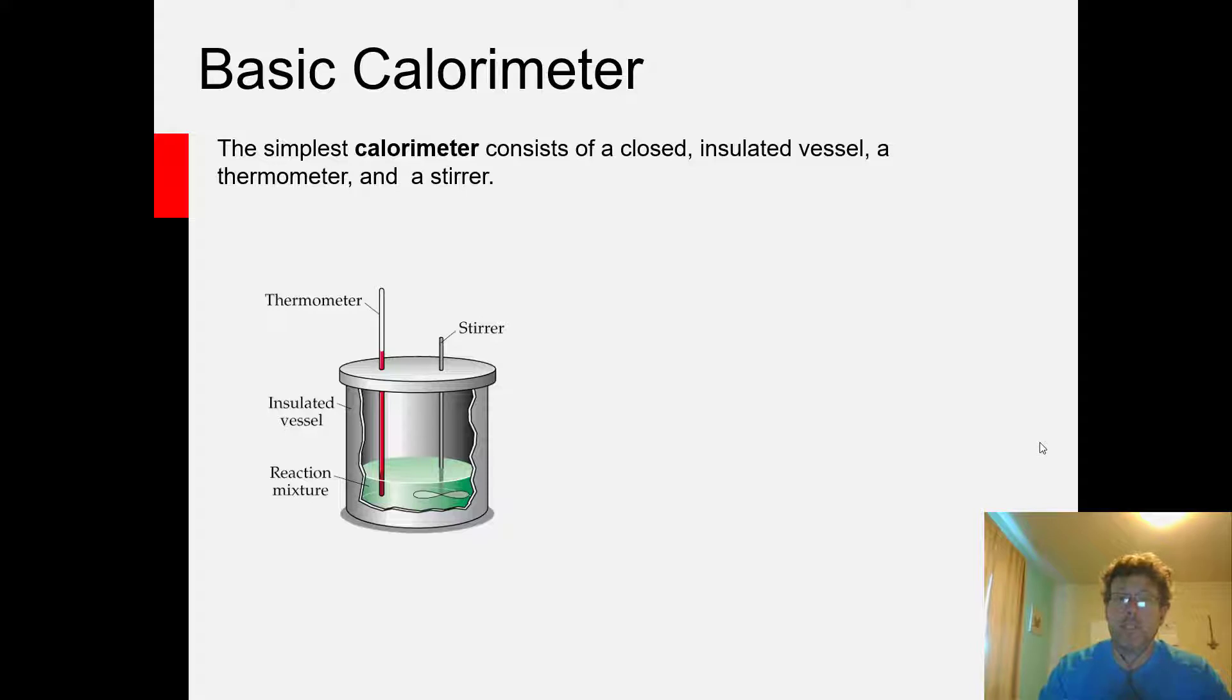You can think of a calorimeter as essentially a styrofoam cooler with a port for a thermometer to go in so you can study temperature change of the process, and ideally some type of mechanical mechanism to stir the reaction, particularly if it's happening in water.